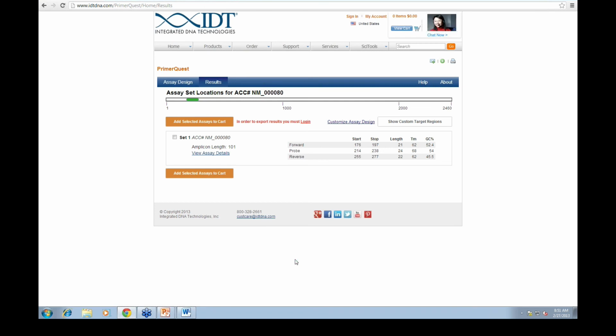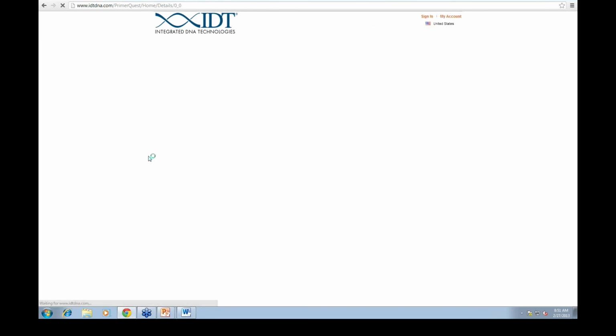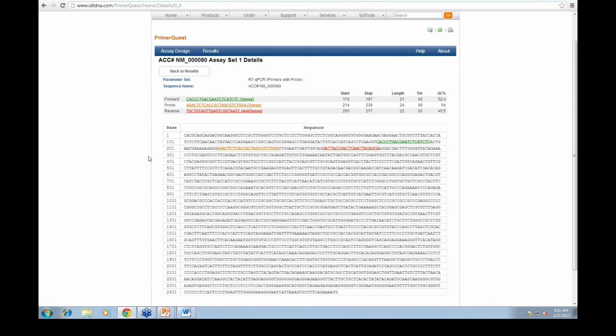It's pretty unlikely that it's going to return more than one probe sequence. Once it finds one that's good, it kind of restricts itself to there. If we also think about it, this only has an amplicon length of 100 base pairs. Obviously, the forward primer is 20, the reverse primer is 20. That restricts it to about 80 bases to work with. As you can see, there's some A regions over here. It tries to make sure it is a little bit of distance away from those primers, and so this was the probe sequence that it returned. I know you guys can't see the PowerPoint in front of you, but I can reassure you that those are the forward and reverse primer sequences that I did input.